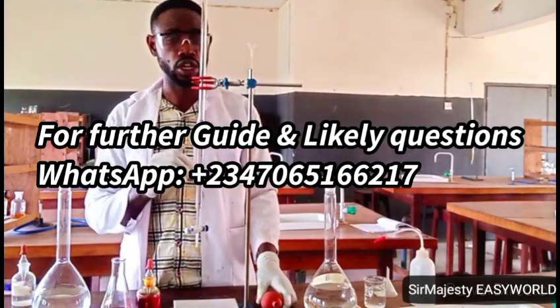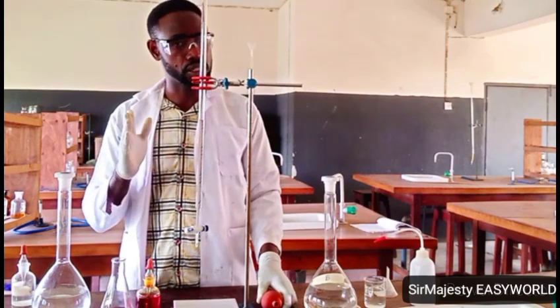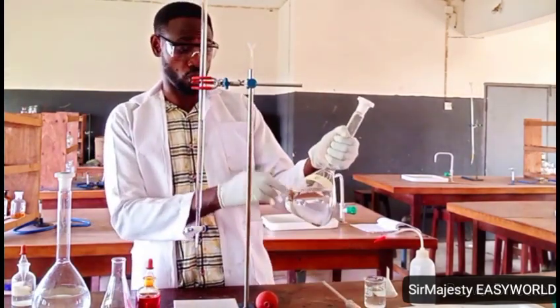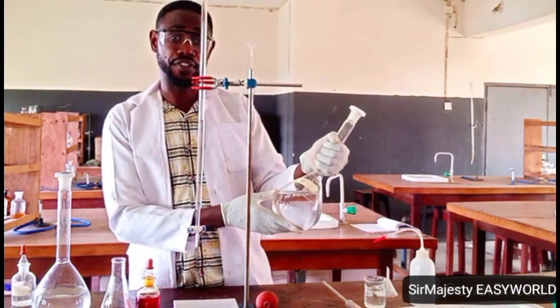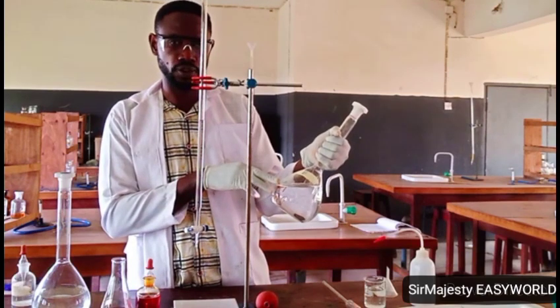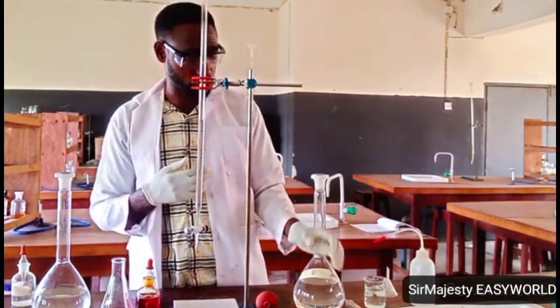But watch my discoveries concerning any titration involving dilute acid and trioxocarbonate(IV), mainly the reaction between HCl or HNO3 and the trioxocarbonate(IV). You see what happens there, and the real chemistry. I told you there is a sort of reaction taking place when you mix sodium trioxocarbonate(IV) and sodium hydrogen trioxocarbonate(IV). From my findings, it's not true that the hydrogen carbonates and the sodium carbonate do not coexist. There's a kind of reaction that takes place, not even to give a new product, but one product is converted to the other. Yeah, from my findings.